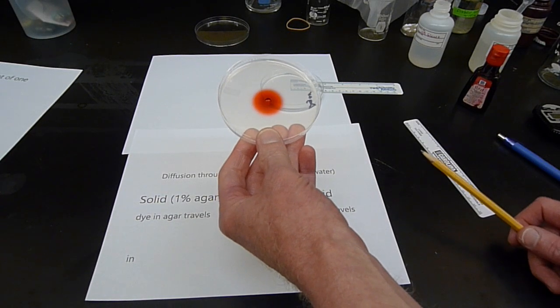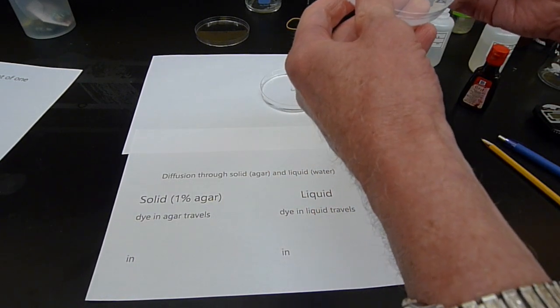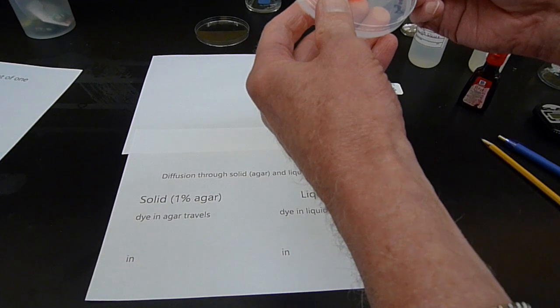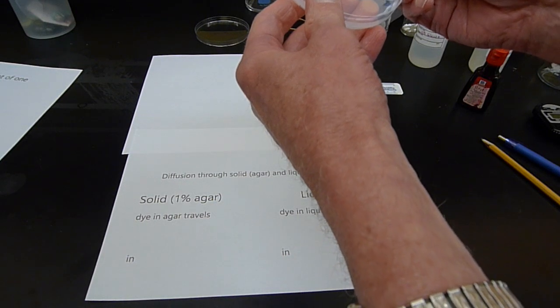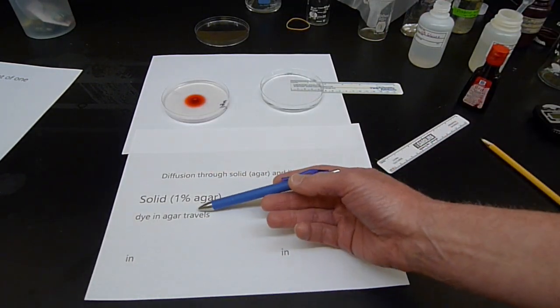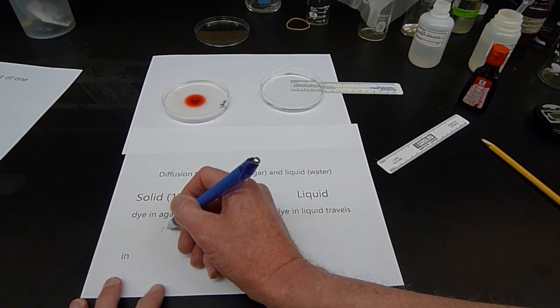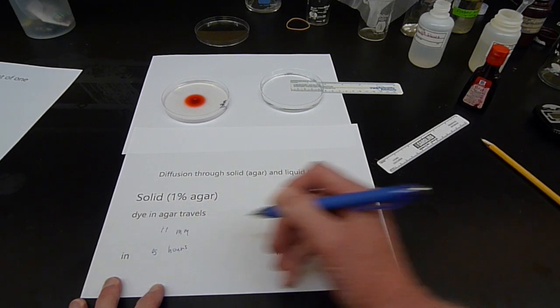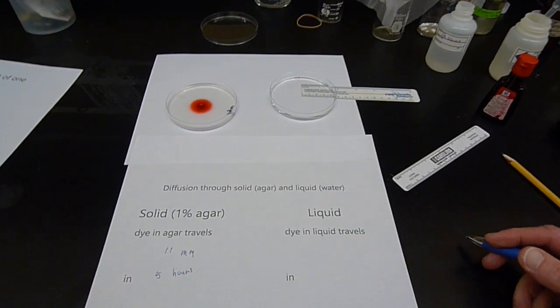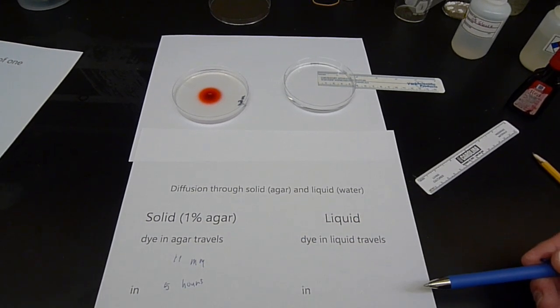That's been diffusing for 5 hours. So I'm going to measure the distance that's diffused here with a ruler. I'm going to measure from the edge of that hole to the very edge of where it's diffused. I'm going to call that 11 millimeters. So in the solid here, it has diffused 11 millimeters in 5 hours. Again, this is going to be difficult to read, I know, on the video, but I will summarize the data for you in a table and post it so that you have access to that, and it's easy to see all the numbers.